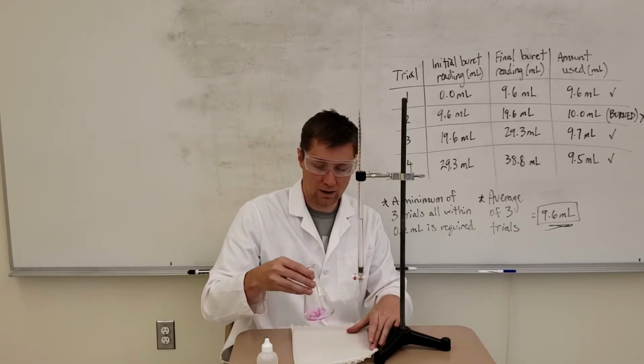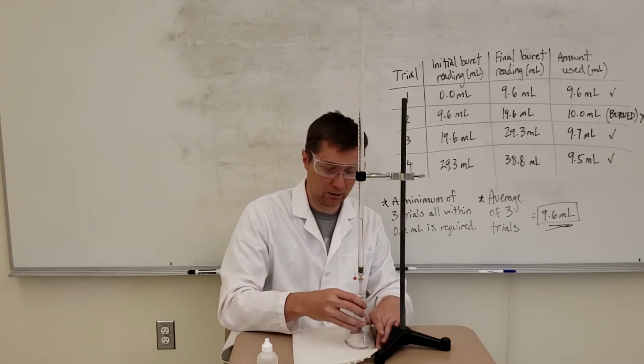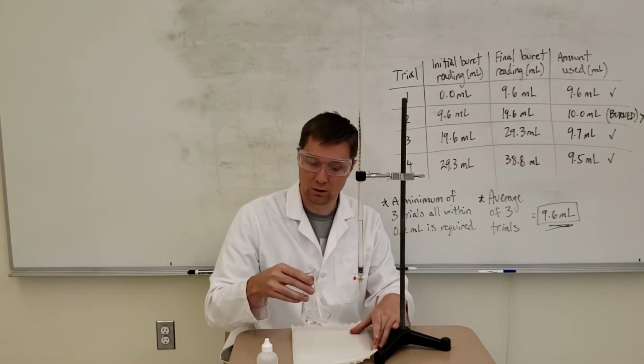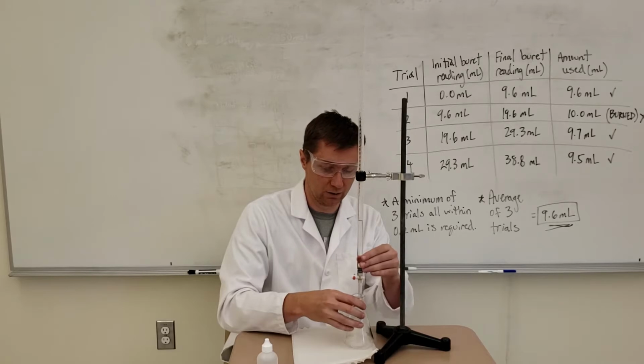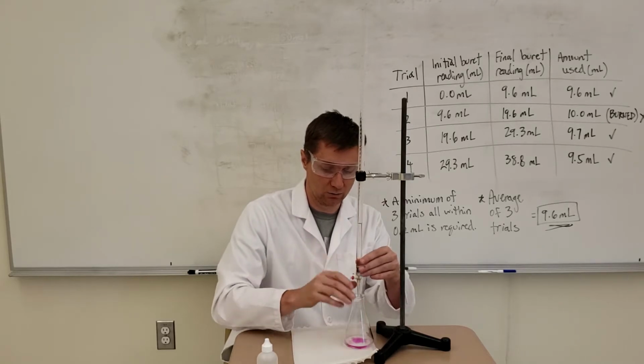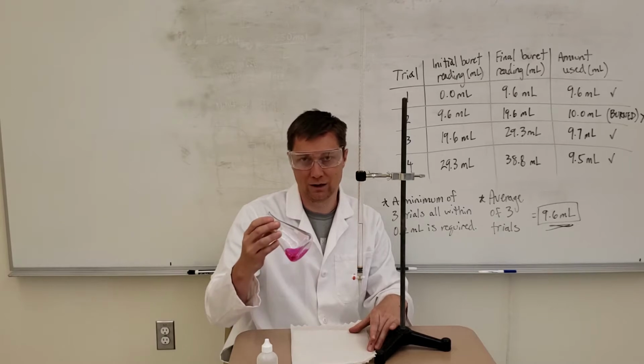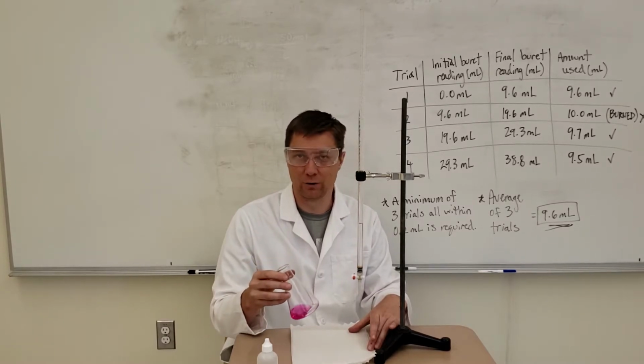And now that pink is taking a little bit longer, so I want to go in just a few shorter bursts of the titrant just to make sure that I don't overdo it, because once you overshoot the solution, like you can see I did right there, then there's no going back.